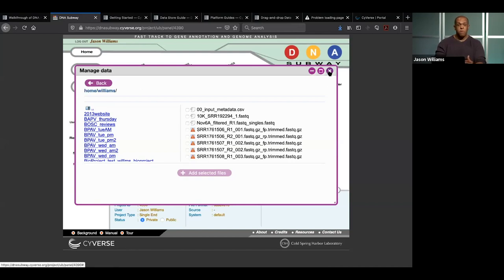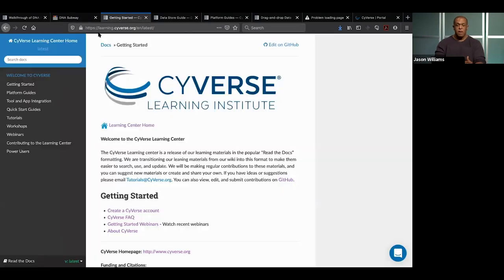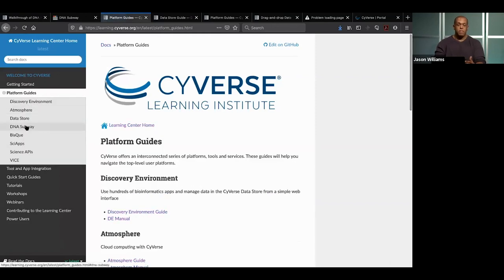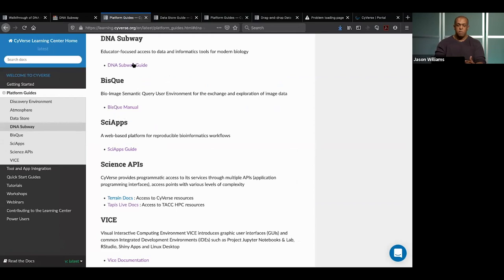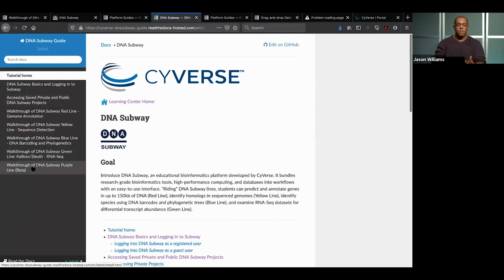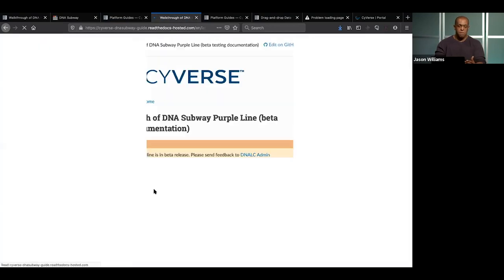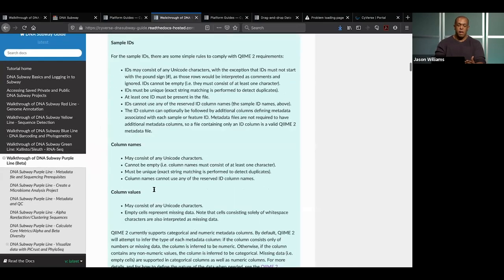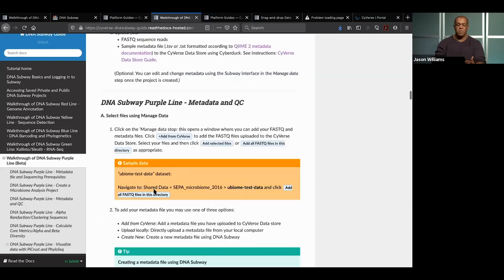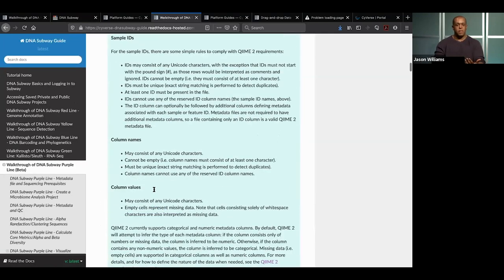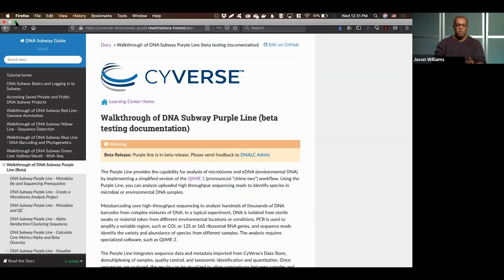The last thing to show before handing over to Bruce: on learning.cyverse.org, go to Platform Guides, click on DNA Subway, and find the DNA Subway Guide. On the left side are detailed instructions for the Purple Line — much more than we can cover in a webinar. The idea of this webinar is that you'll be able to go through those written materials with more comfort and ease.